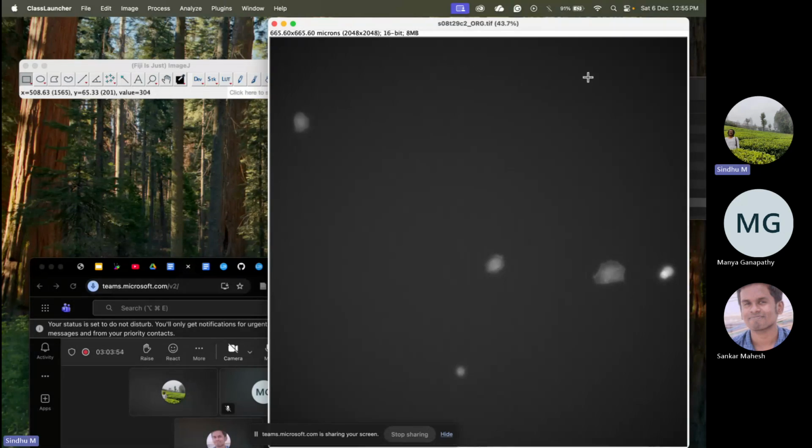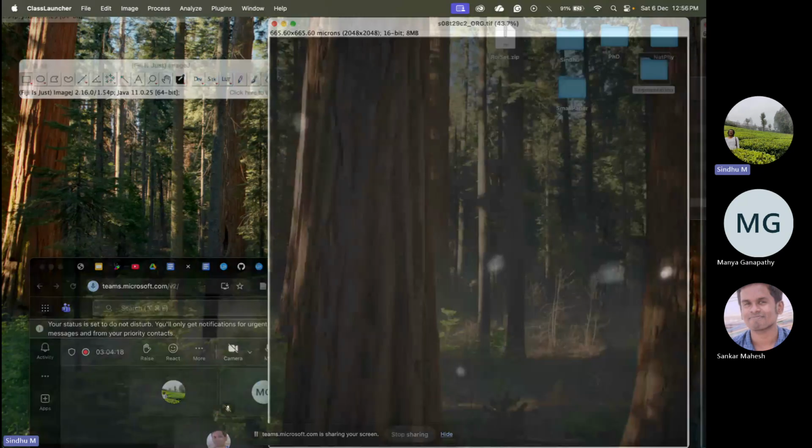And if you go to the right, right now x is 144, and it increases as you go right. Which means that the x coordinate of 0 is on the left side of the image, and the y coordinate of 0 is on the top. So the top left is where you have the 0,0 coordinates.